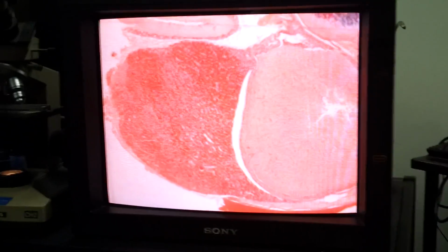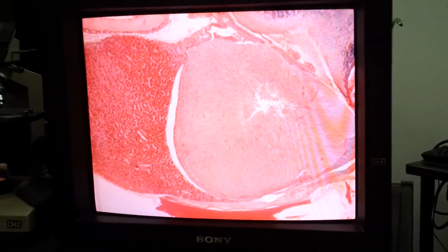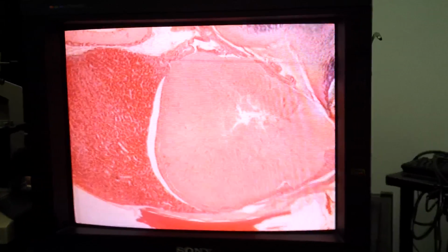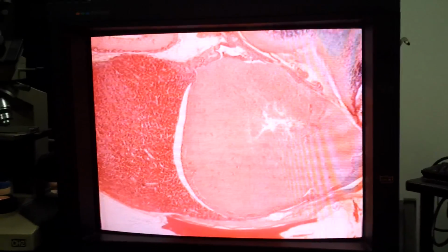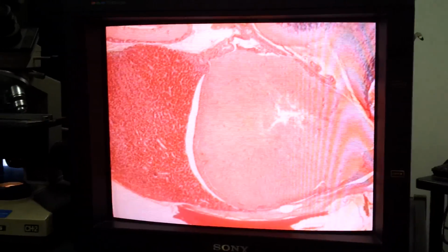And if I ask you to name a hormone made by cells stained bright red, you would say GH, growth hormone. Somatotropes, roughly 60%. Growth hormone or prolactin are both made by them. Somatotropes, mammotropes, or somatomammotropes if there are any in the pituitary.